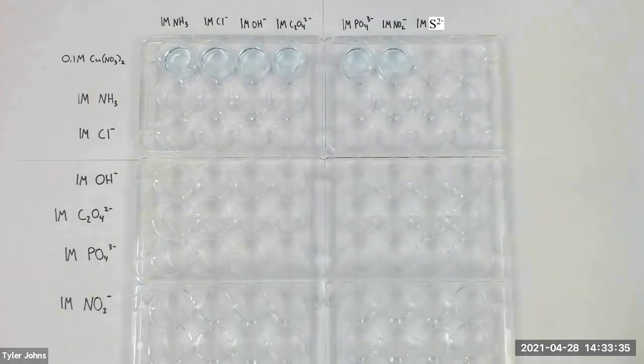We will next add one milliliter of one molar solutions containing the species listed at the top of each column. We will mix the reagents in each well and the contents of the top row of wells will serve as a reference during the rest of the experiment. For now, we will omit the sulfide ion and come back to it later.